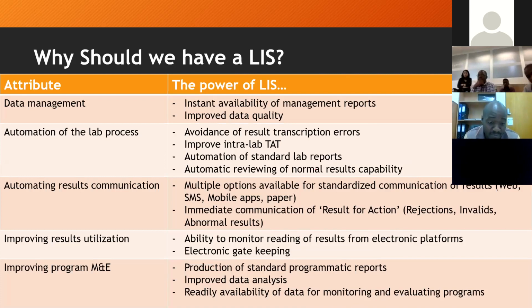There's also a capability of electronic gatekeeping, which is managing resources. When a sample has been collected and the result is available, the clinician doesn't have to re-request or reorder a test because the result is already available.